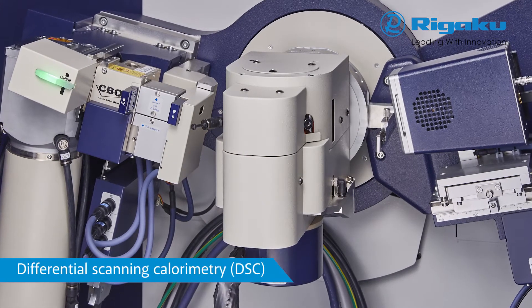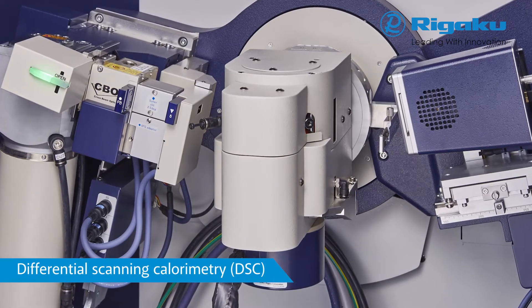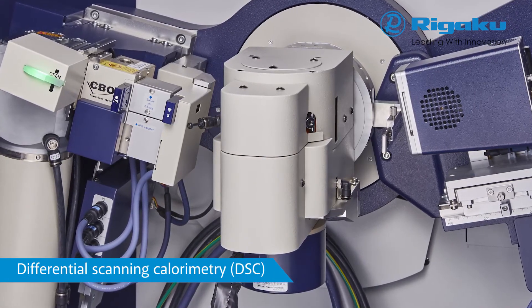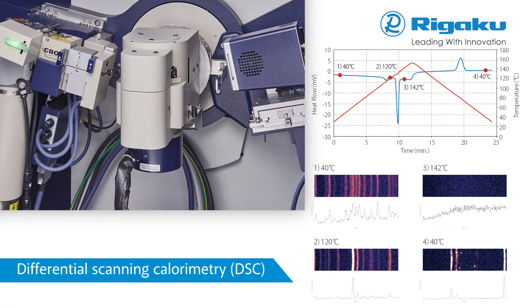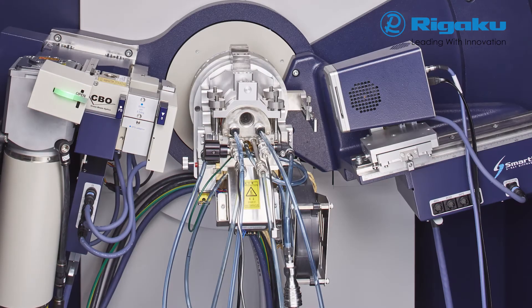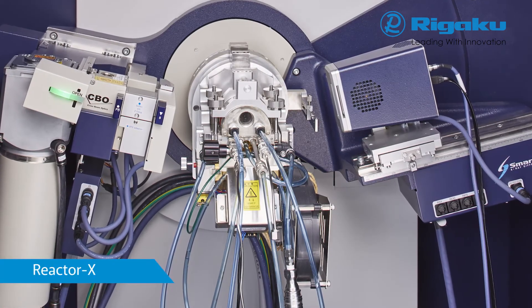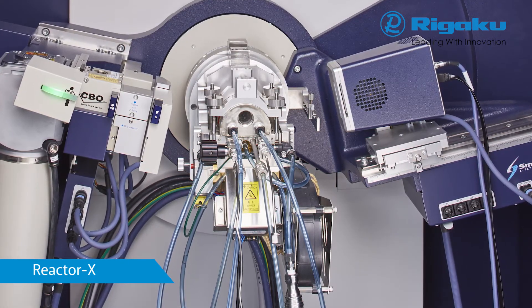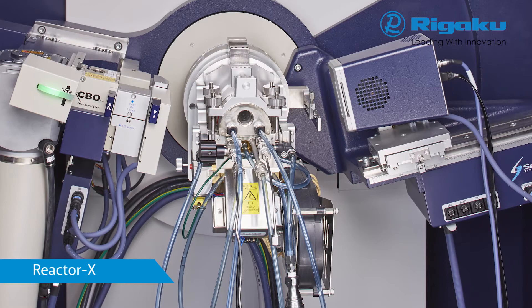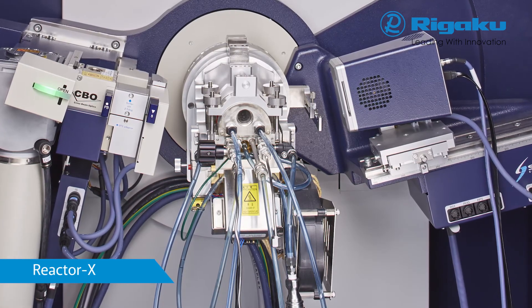In-situ measurements observe changes in sample state with variations in temperature and humidity at the same time. SmartLab SE supports a variety of in-situ attachments such as for differential scanning calorimetry. The example shown is the phase transition of the drug tolbutamide. Reactor X allows in-situ measurements to be performed under high temperatures up to 1000 degrees Celsius in vacuum, inert gas, reactive gas, or a mixture.